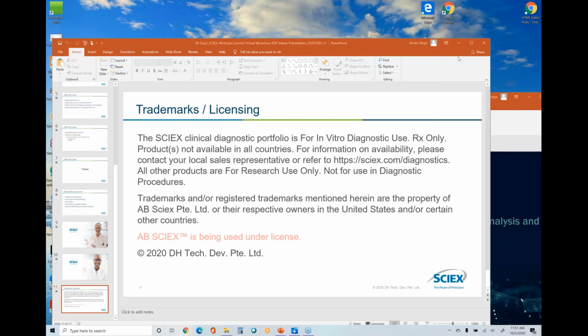Once we have that, it's semi-trivial to take a vendor-specific MassSpec data model and add it here. This whole application end-to-end is very modular, and we've anticipated having standards on both ends that can be utilized.